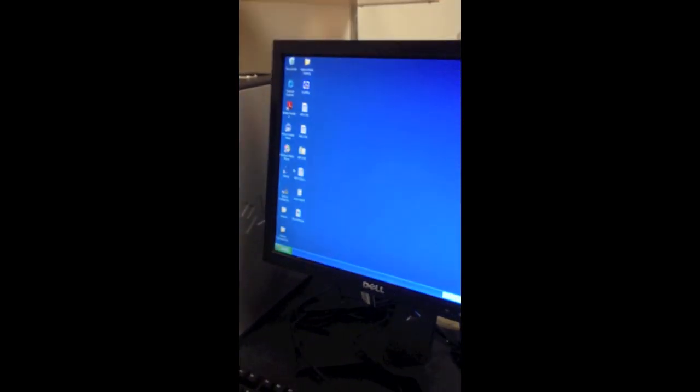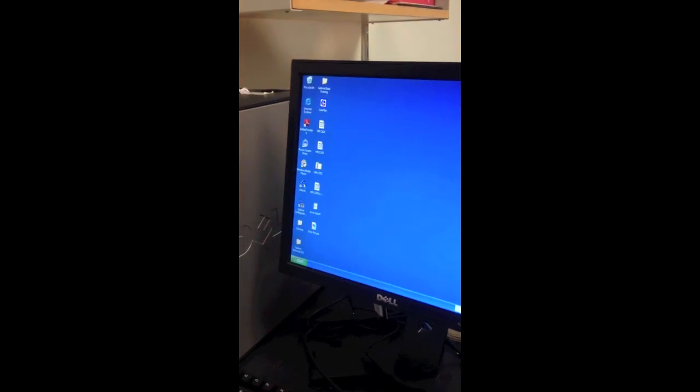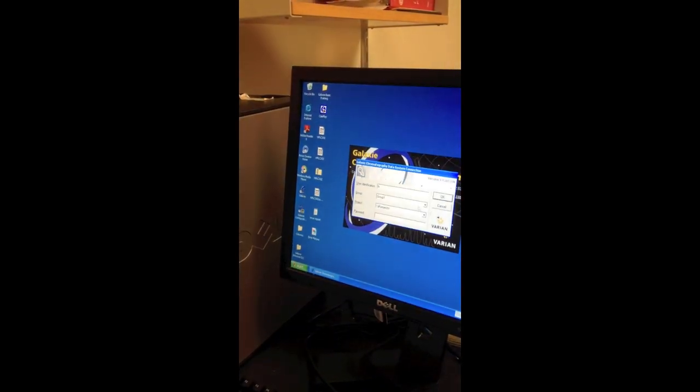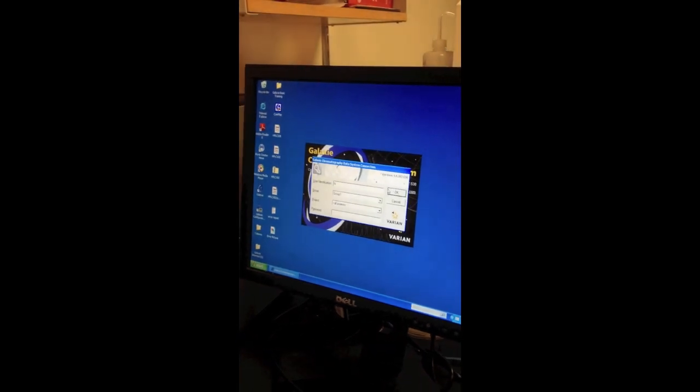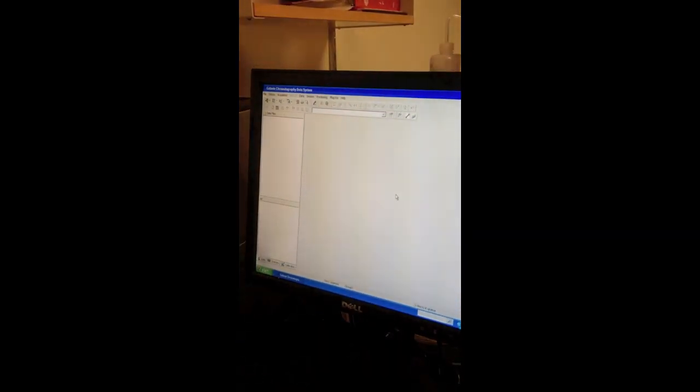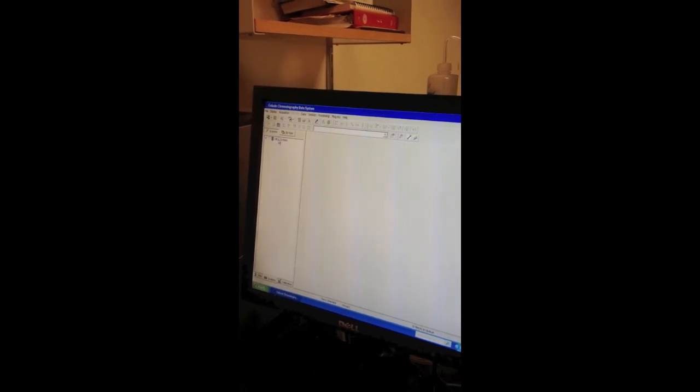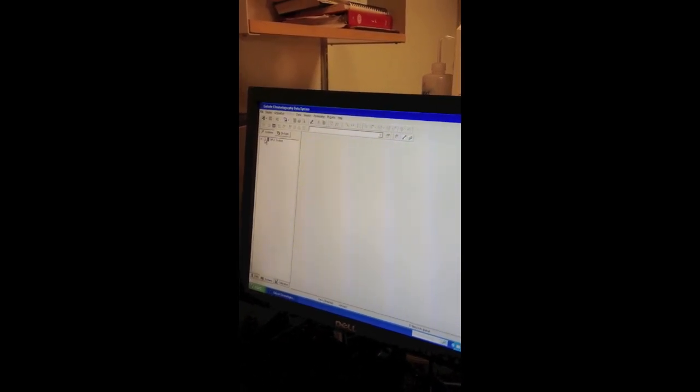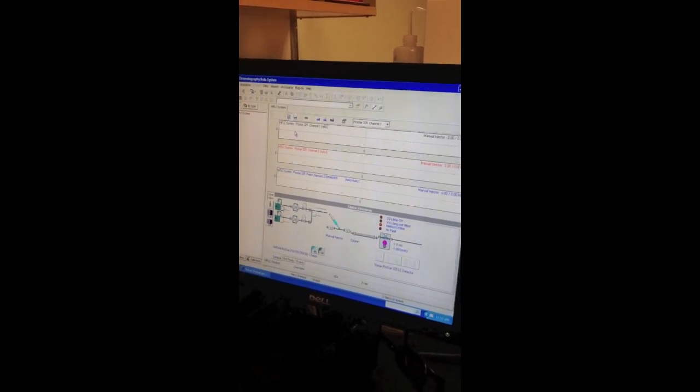So now going over to the computer and turning on the program. Click on the galaxy icon. Click OK, there's no password needed. Down here you'll see data, systems, calibration. Click the systems tab. Then it will have HPLC system with an empty box next to it. Check that. So now here are the graphs. Channel 1 and channel 2 just indicating the different wavelengths. Here are the pumps.